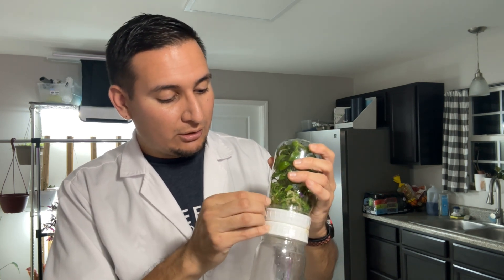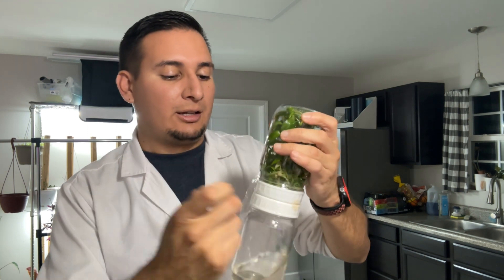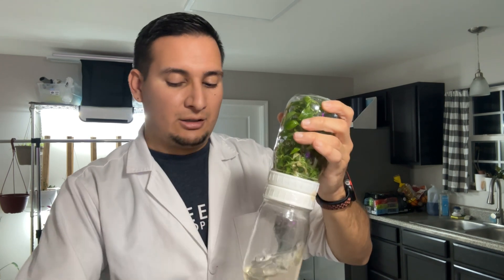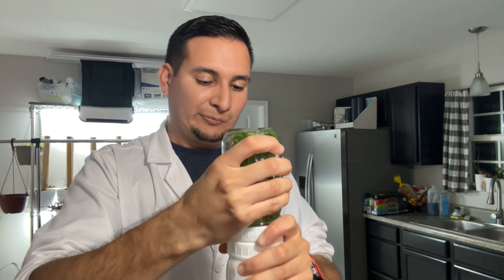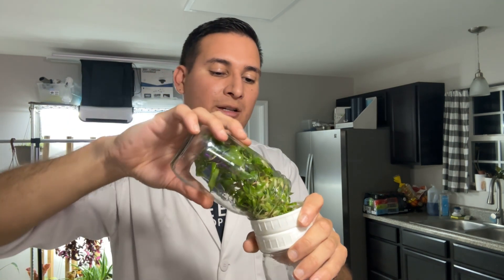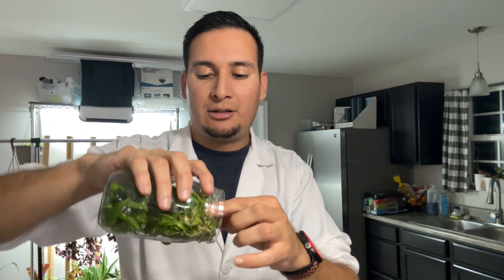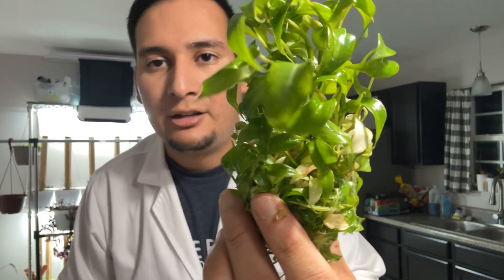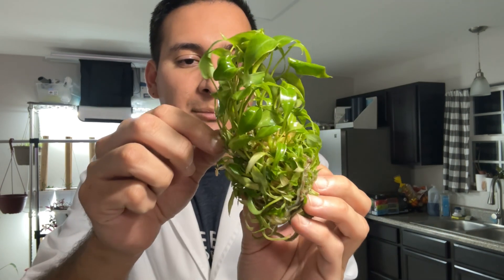So let me stop talking and show you what I'm doing. First, I want to take the wrap out of the top jar and open this up. I have some roots — let me pull them up. Look at these plants — very healthy, a lot of plants.